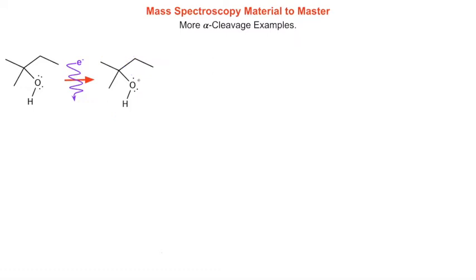Here we go. So in a mass spectrometer, you have a molecule. It gets injected into the mass spectrometer. An electron beam can come through and hit it, knock off an electron. It could knock off a lone pair electron, a sigma bonding, or a pi bonding electron, but we don't have pi bonding. And I think it most often takes off a lone pair electron. Then we can calculate our molecular formula for this molecular ion and use its most abundant isotopes to get its mass to charge ratio. And it's a high energy thing. It's got a radical and a cation.